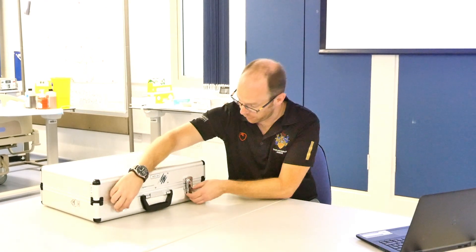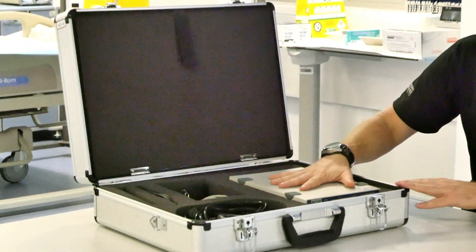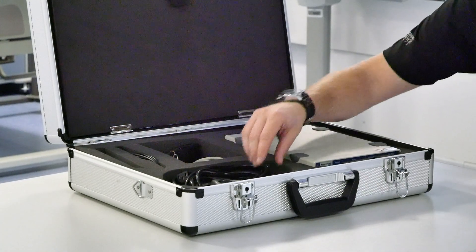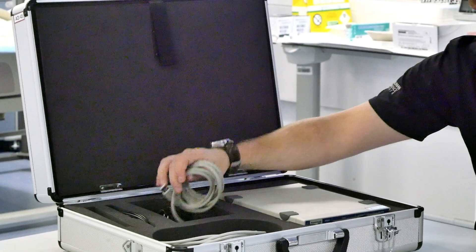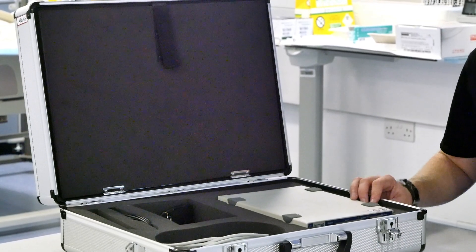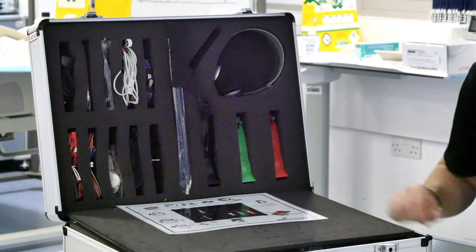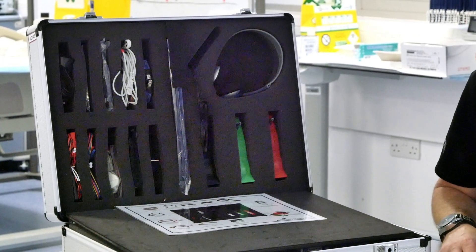As you can see, the entire system comes in a suitcase. When you open the suitcase you'll see the actual PowerLab computer system along with a compartment that contains power cables and a USB cable to connect the PowerLab to the laptop. Next to that, in the top of the case, there are many different plugs and inputs that you can use for the different practicals.